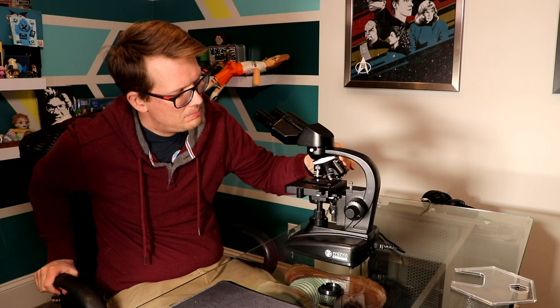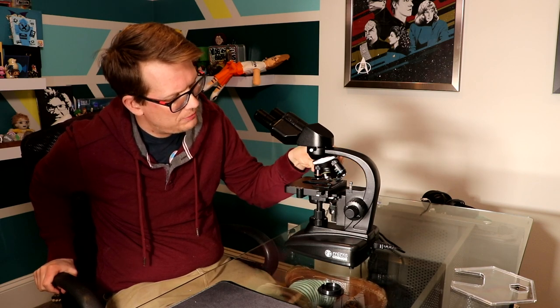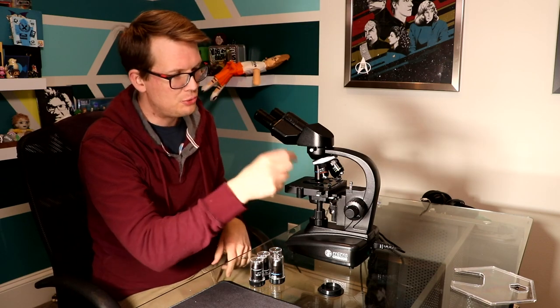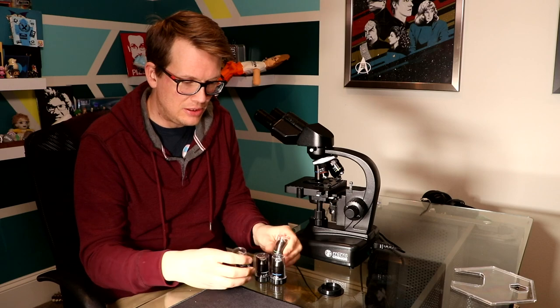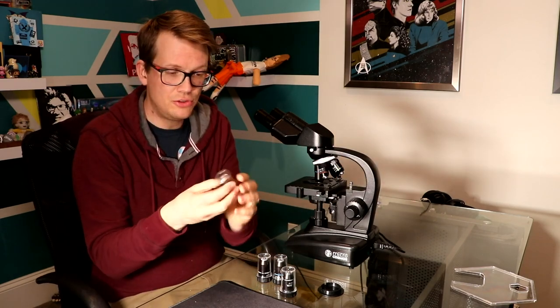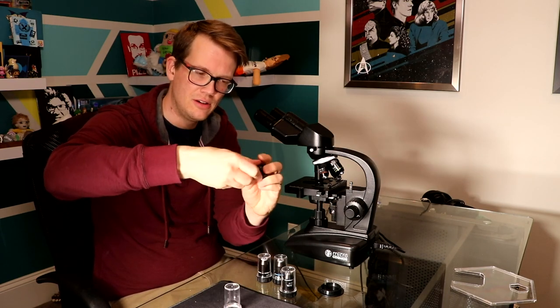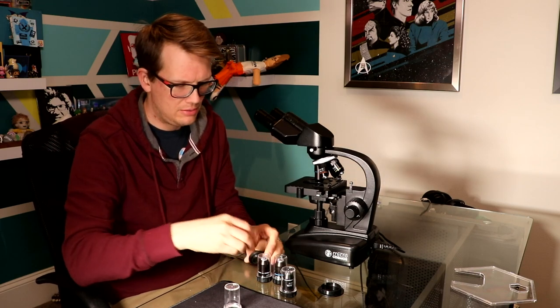You can move this around so that you start with your 40X magnification, go to 100, then 400, and then on here we've also got 1000. This is what the microscope comes with. If you've got the plan objectives, those are right here. The 1000X magnification is oil immersion, so you need some microscope oil which will come with your kit. You drip that onto the slide, then slide the objective into that oil, and the oil actually becomes a part of the lens — without that you can't use the 1000X magnification.